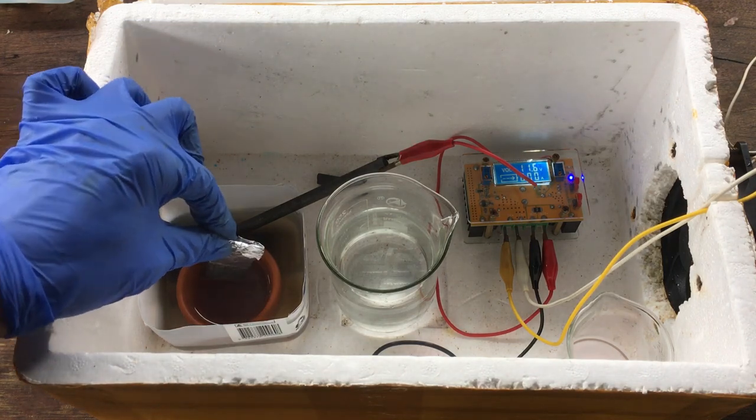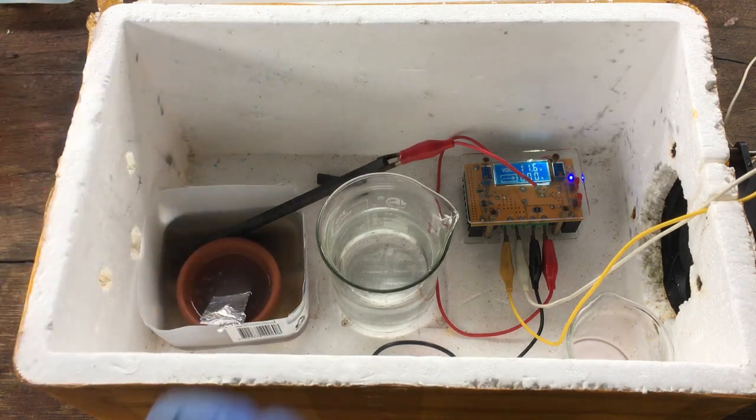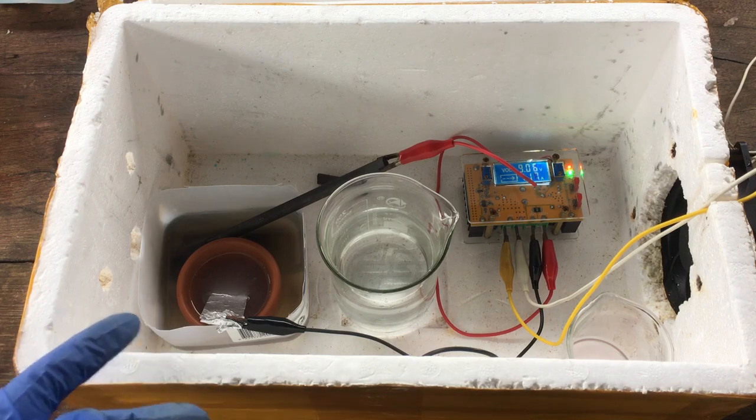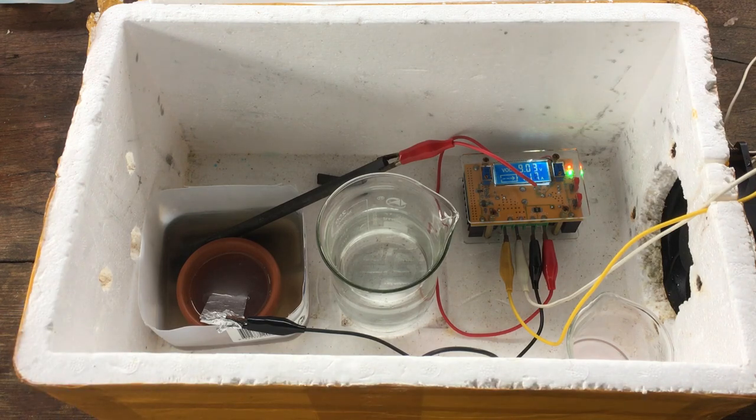So I'm going to leave the cell running for possibly a whole day and see just how much manganese we can get out. Hopefully we'll be able to get out a significant portion of that. I'll get back to you tomorrow, provided nothing catastrophic occurs, and hopefully we'll have a bunch of manganese metal.